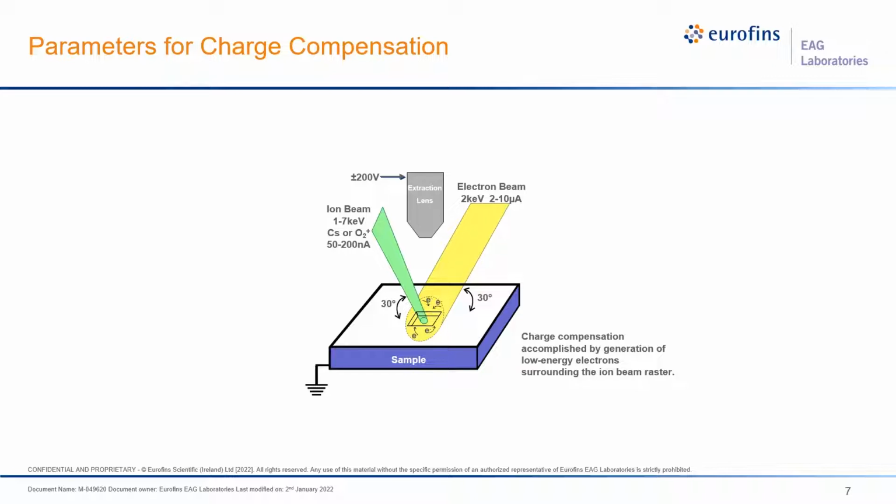So almost always we use a low energy electron beam in the vicinity of the crater that the ion beam is hitting to neutralize this charge buildup, so we can essentially collect the ions coming off the surface with little impact of the charge buildup in the material. This is particularly important when we're doing alkali ion or impurity measurements in bulk insulating samples, and I will show examples of how this can go really wrong.